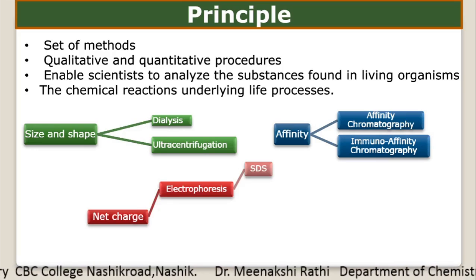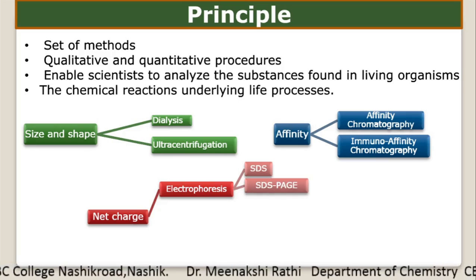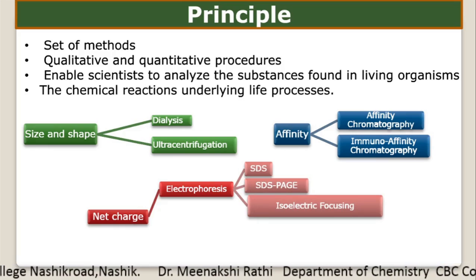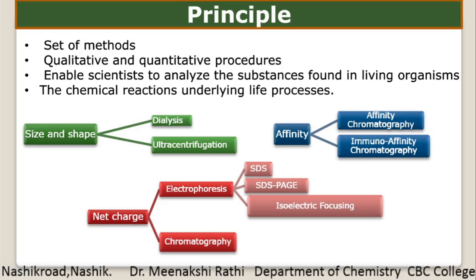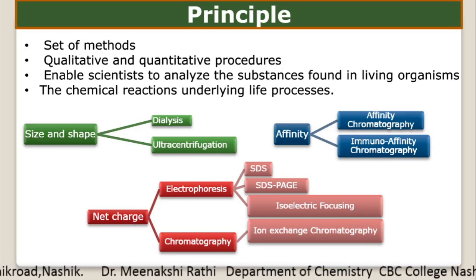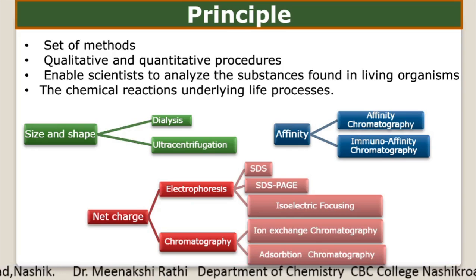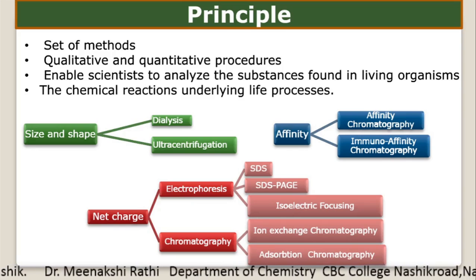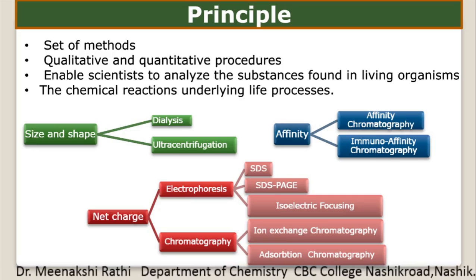Under electrophoresis, we are going to discuss SDS page and isoelectric focusing, while another method which is also based on the net charge of the molecule is chromatography. Here we are going to discuss ion exchange chromatography and some adsorption chromatography. So these various biochemical techniques we are studying in this chapter.